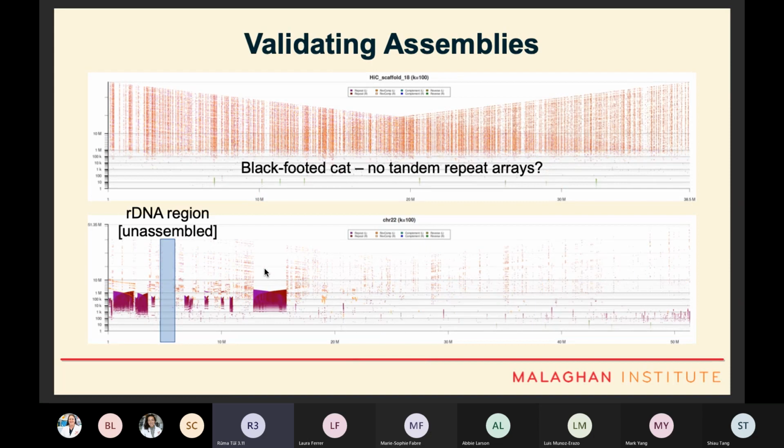Over the past few years, I've been running my REPAVER visualization program on the longest assembled genomes that I can get my hands on. It's not uncommon for me to look at something that the authors claim to be a multi-megabase chromosome scale sequence, but it has an almost complete absence of tandem repeat regions. That seems to be a very common feature of most chromosomes. But we're getting there, and quite rapidly.